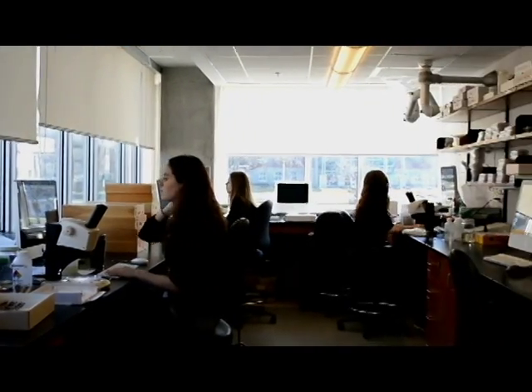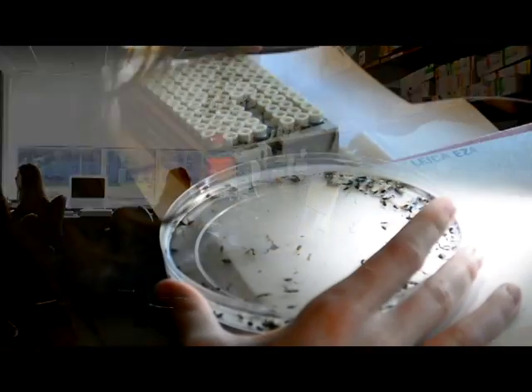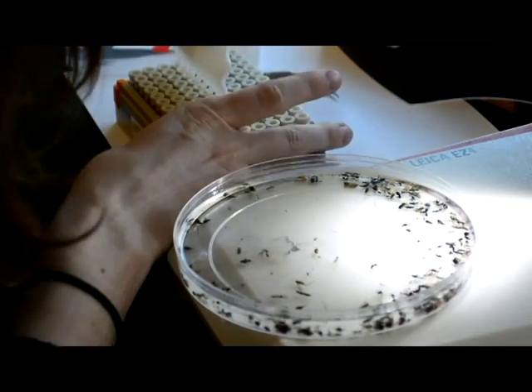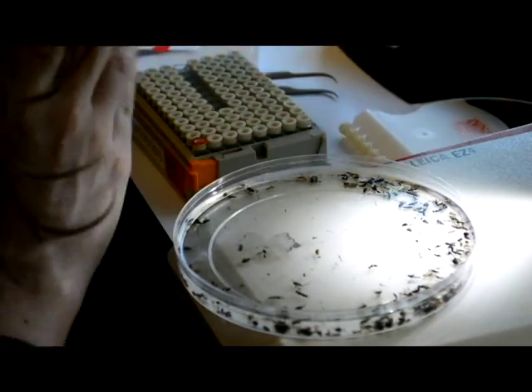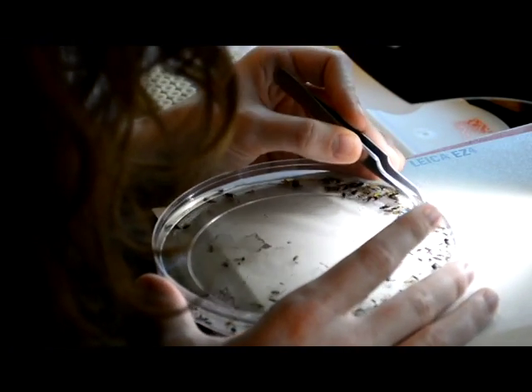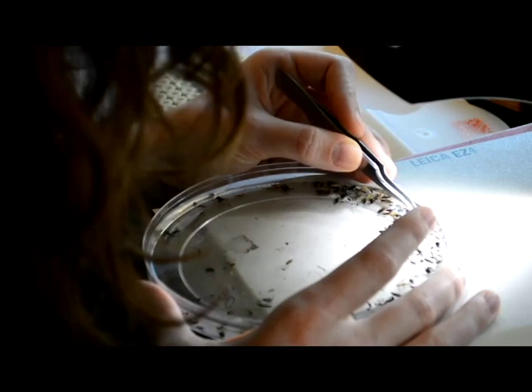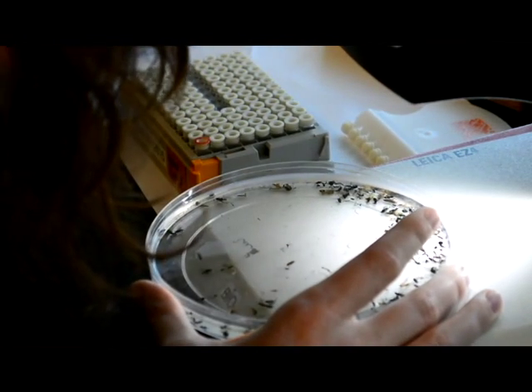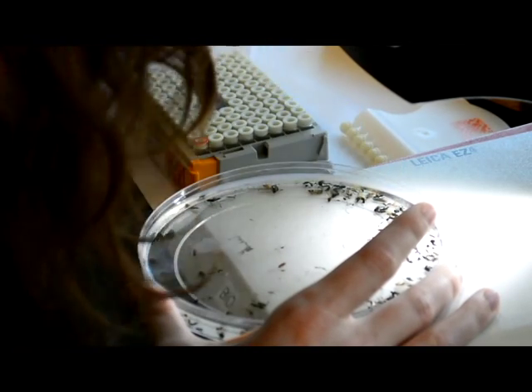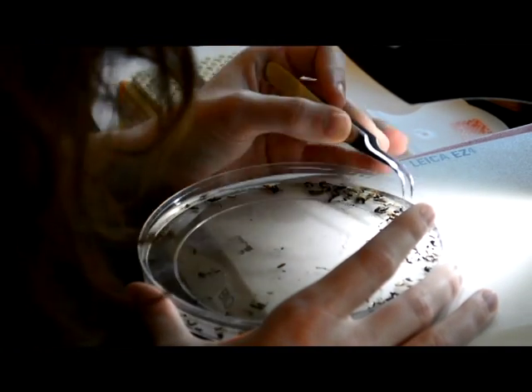The staff records details on the collection location from each bottle and compiles the weather data you recorded. Next, the contents of each bottle are poured into a sorting dish, and using a microscope, every specimen is counted for each trap. Our staff then attempts to pick as many different species as possible and selects up to 285 animals for our DNA barcoding work in the lab. This process will eventually lead to about 18,000 individual insects for which we will try to obtain a DNA barcode.